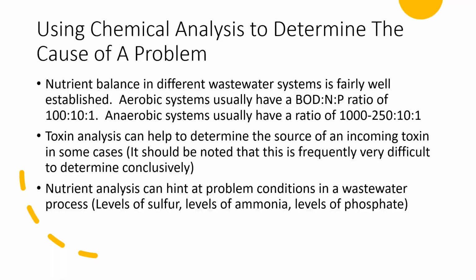There's a couple different ways you can look at this. You could look at ammonia as the N, or you could look at total Kjeldahl nitrogen, which is organic nitrogen, as the N in the ratio.